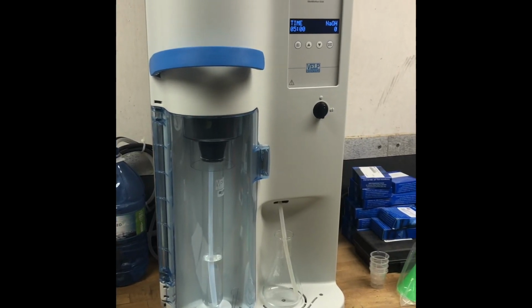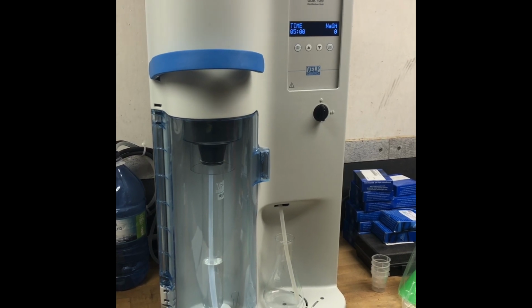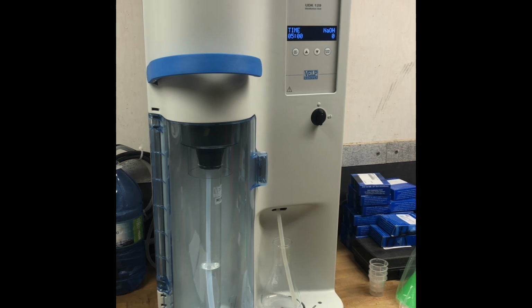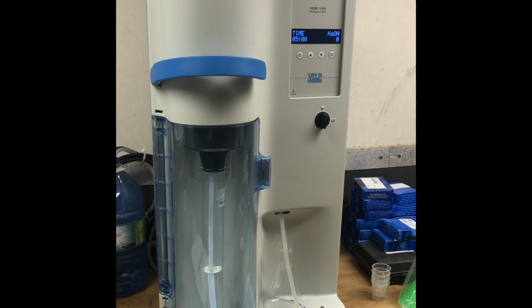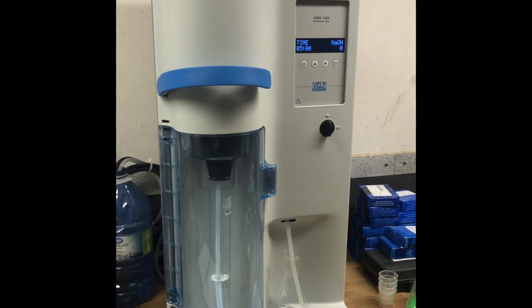Okay, so this is the VELP UDK 129 laboratory distillation unit. I'm using it to distinguish between free ammonia and amines, amides, other types of ammonia locked up in organic molecules.